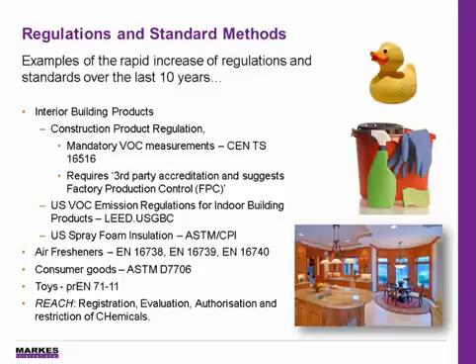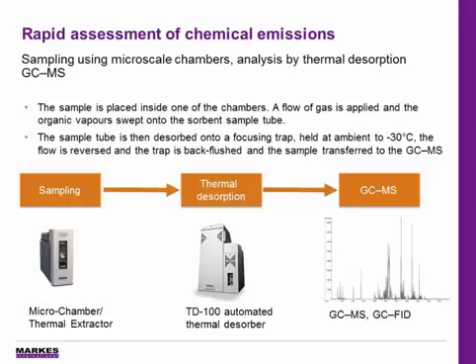Most of these certification standards are very time-consuming. Typically, you would place a piece of material into a 1 meter cube chamber for up to 28 days before you can take the test.